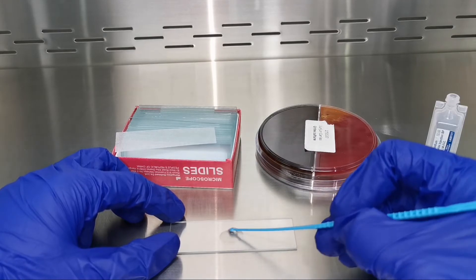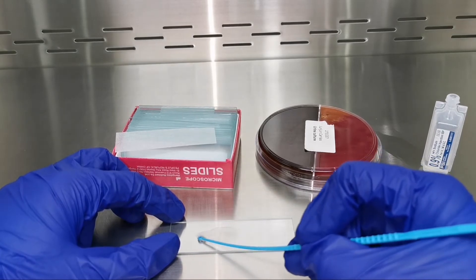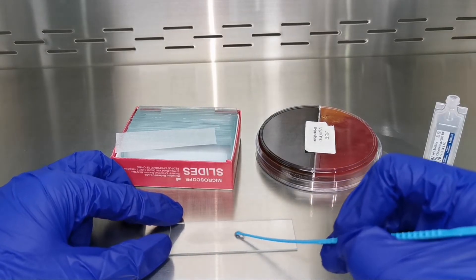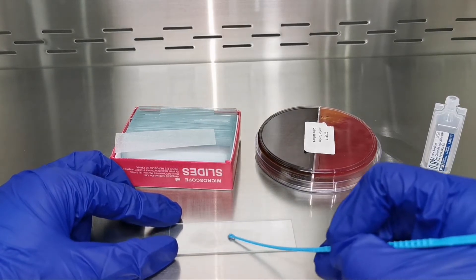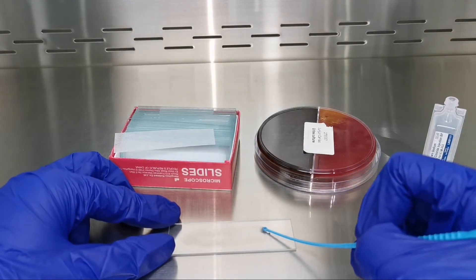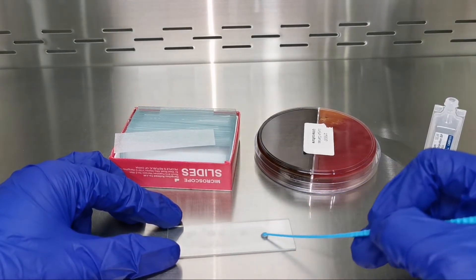In a circular motion, mix it with the normal saline to emulsify the colony. We spread it so that the bacteria will not be overlapping — spread it all over the slide. After this procedure, we let the slide air dry.